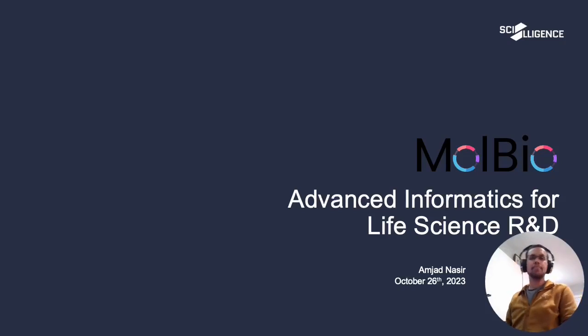Hello everybody, my name is Amjad and I lead the development of bioinformatics capabilities here at Scilligence. Today I'm excited to present to you on Molbio, a solution that we're developing in-house to address molecular biology needs.